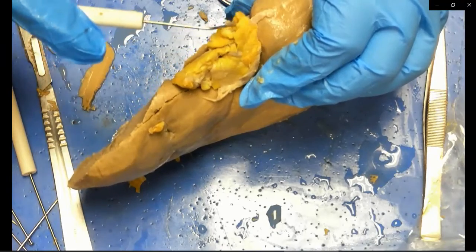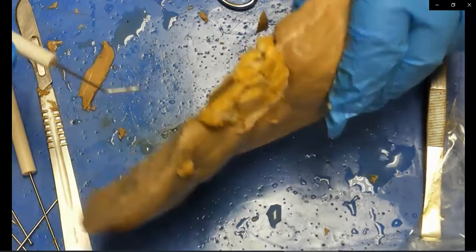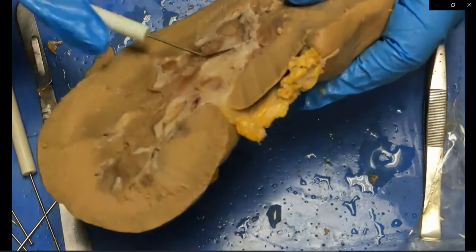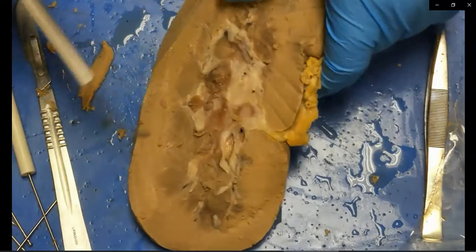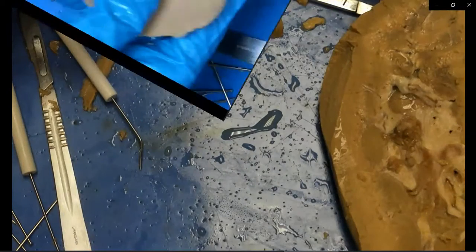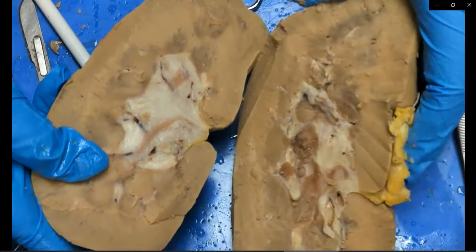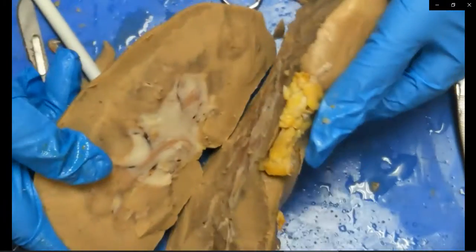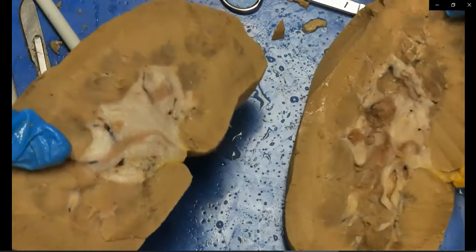So actually, let me pull another kidney that has a more clear ureter. This is a pig kidney. I didn't mention that before, but just so you guys know that we're not messing with some human kidneys, we are messing with some pig kidney. So on this kidney, you'll see that they compare in size. They're pretty much the same. This one over here that we were looking at earlier is just a little thicker.